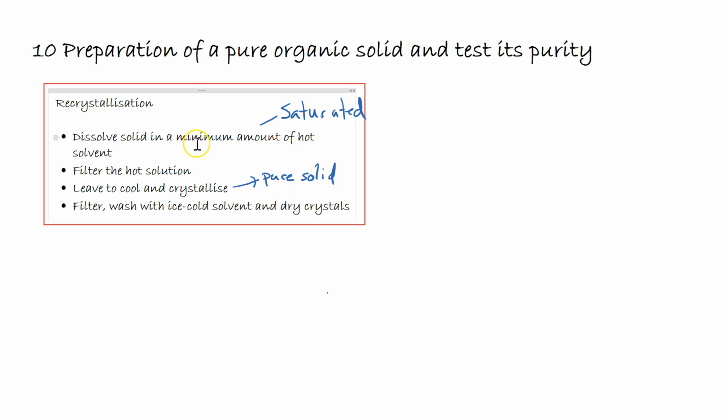Once we've collected the organic crystals in a beaker, we can filter this substance and wash with a small amount of ice cold solvent. We're using ice cold solvent so only very small amounts of it will redissolve. We won't add drying agents, we'll simply put it somewhere warm to dry the crystals so that we can check the purity at a later date.